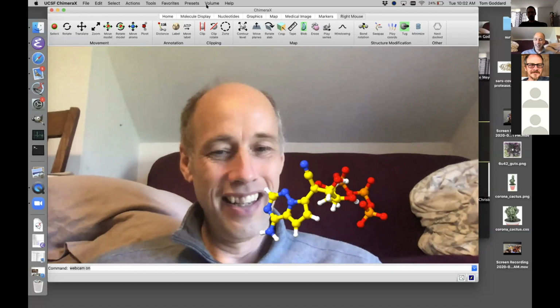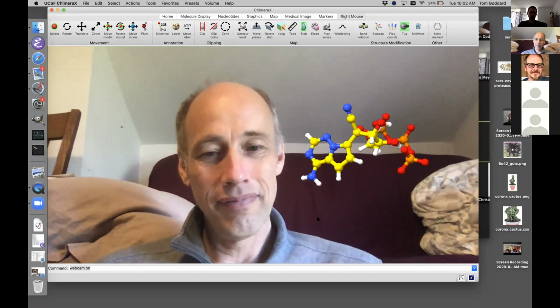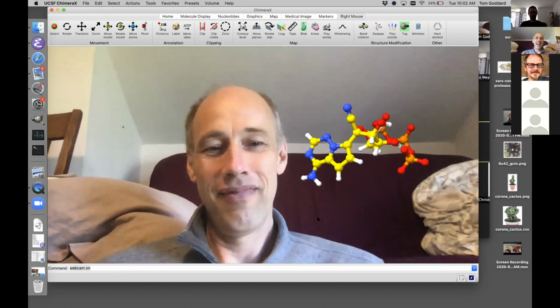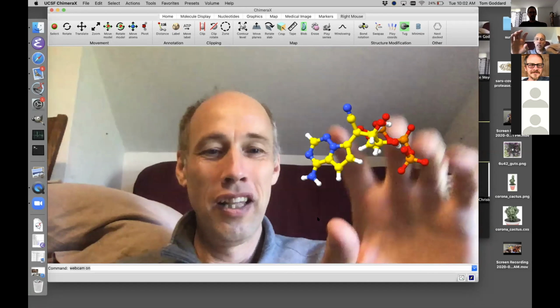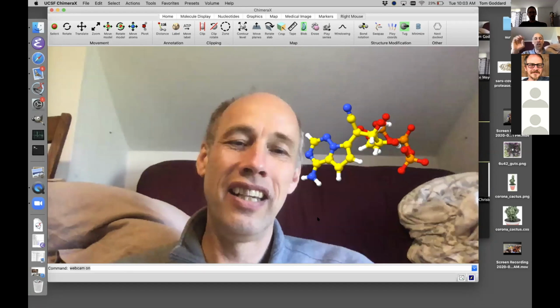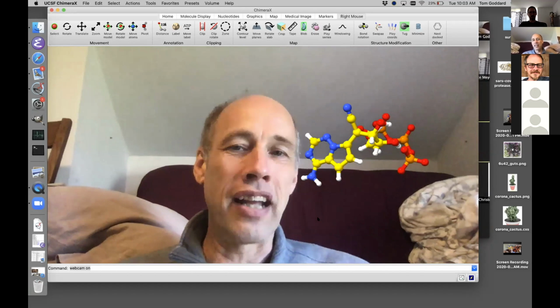I guess one question about using hardware that people have and hand tracking. Have you thought about just interfacing with a cell phone that has accelerometers and orientation sensors, using that as a really expensive 3D mouse? Yeah, I've thought about it. I've been very much tempted to do it the last couple of years, to move this molecule around more fluidly and easily. It's just locked to my cell phone. I have my cell phone in my hand. I just move the cell phone around and it tracks. Sadly, it's not technically very easy.